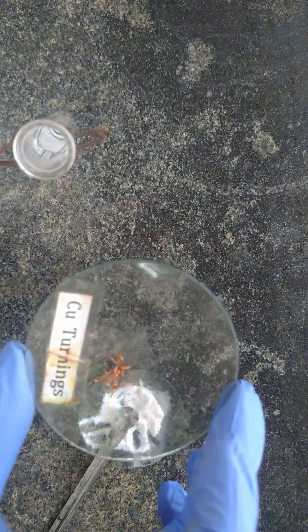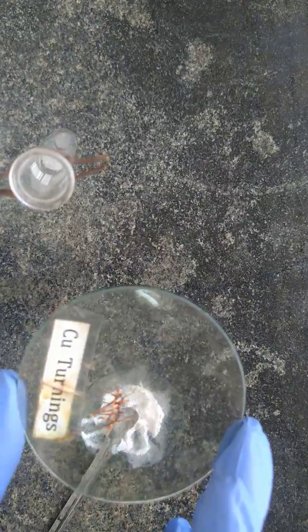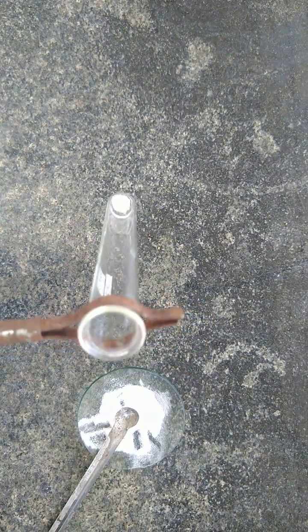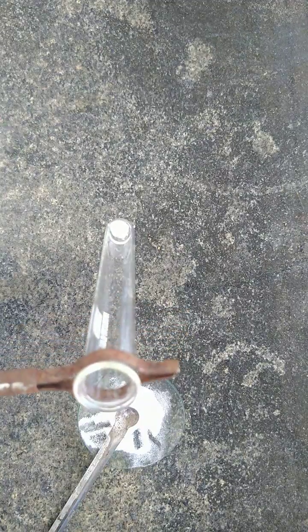So if there is no action after the addition of concentrated sulfuric acid, we are going to add the copper turnings. You can see here we have the copper turnings. So to the test tube containing salt plus concentrated sulfuric acid, we are going to add the copper turnings.